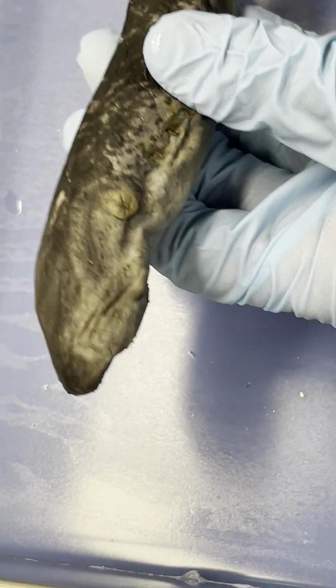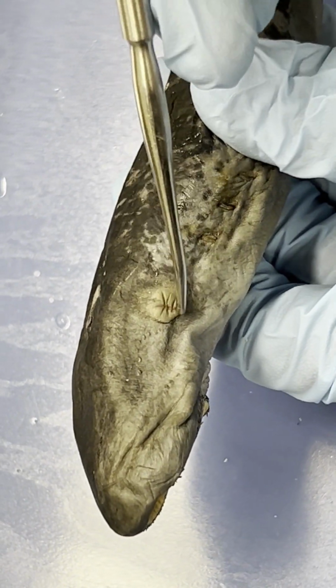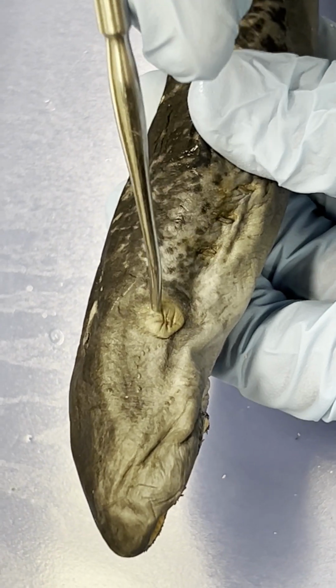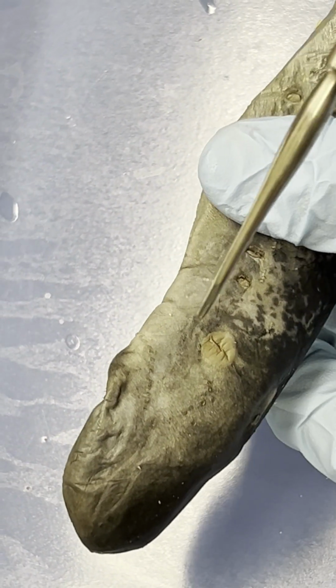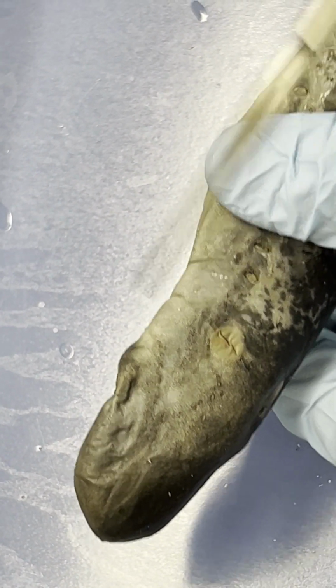Eyes. Here's one eye right here. It looks a little foggy. If it was still alive and not preserved, it would actually be clear. And just like us, they have 2 eyes. So here's the other one.